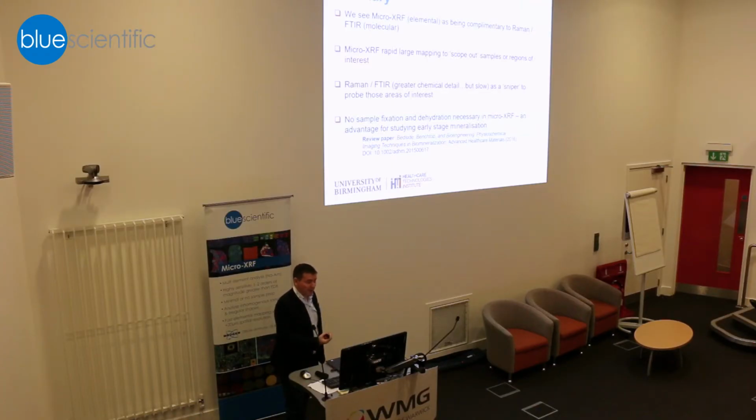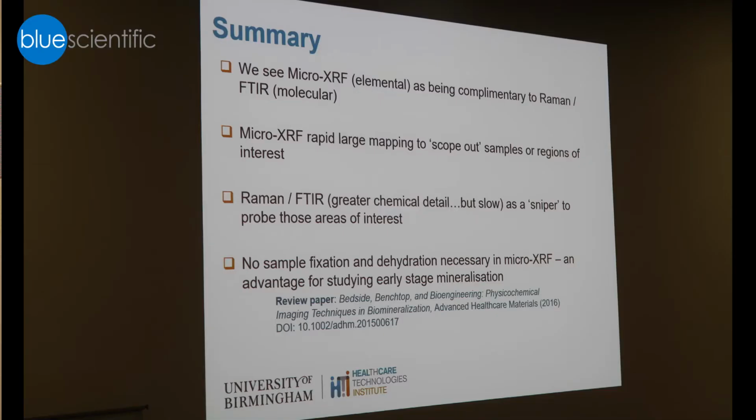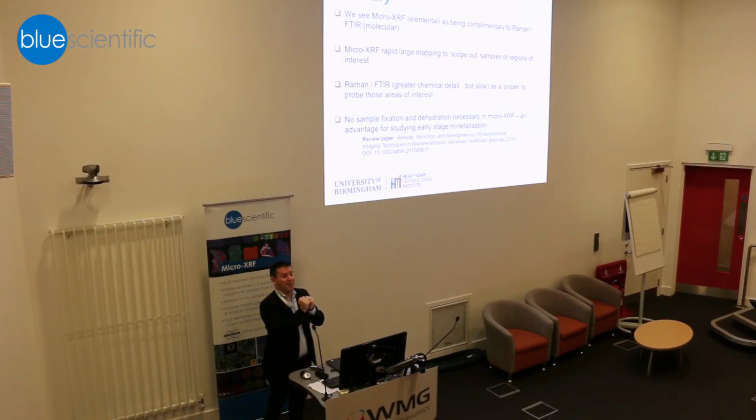The key advantage for us, particularly in our mineralization work, is that the big downfall of a lot of our older techniques is that they relied on sample fixation and dehydration. Well, you can think that if the cell has got lots of free calcium and phosphorus, what's the downside of dehydrating there? You can end up getting condensation of those phosphorus, which for us could risk giving us a false positive for mineralization. So we wanted a system where we could look at the tissues of the samples in as fresh or native condition as possible.